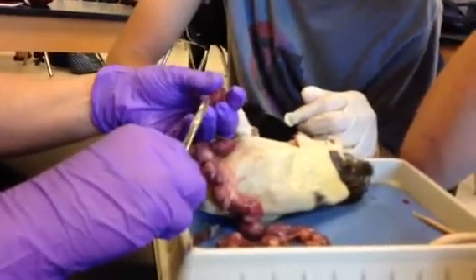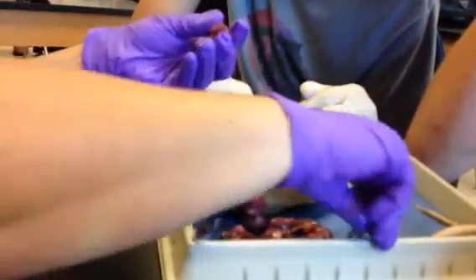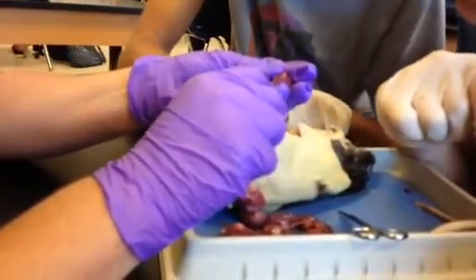Do you want us to give birth to all of them? Yes. Okay, and you can have people help.